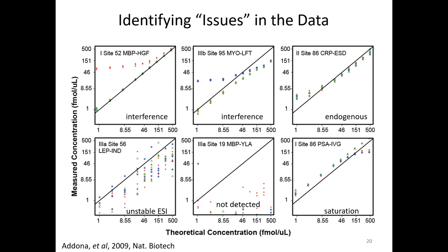All right. Other ways you can look at your data, particularly for interferences or if something's wrong with your instrument, is to look at the data in plot format. So Skyline can do this, and there's an external tool called Quasar, which can also do this. And it'll plot each transition as a different color. And this is shown on the log scale.